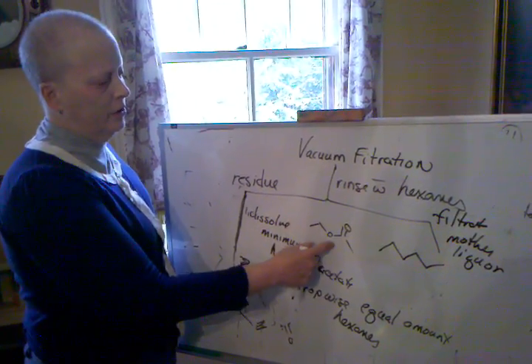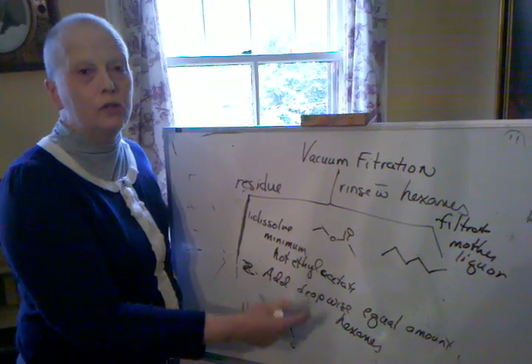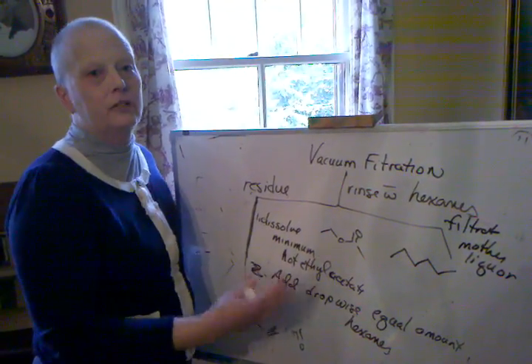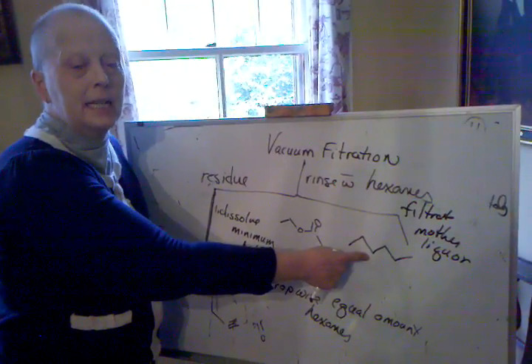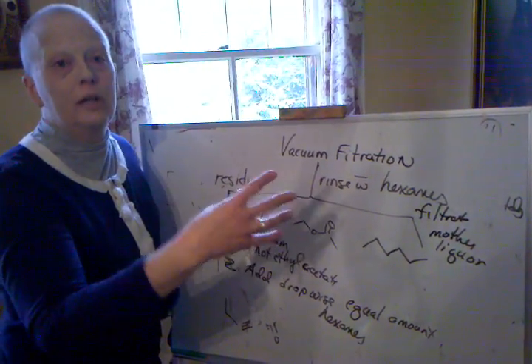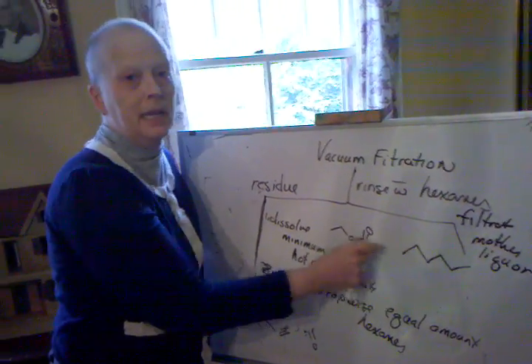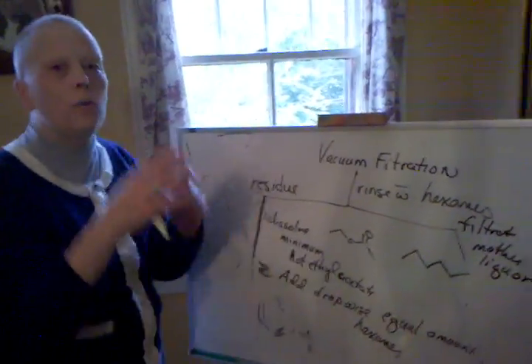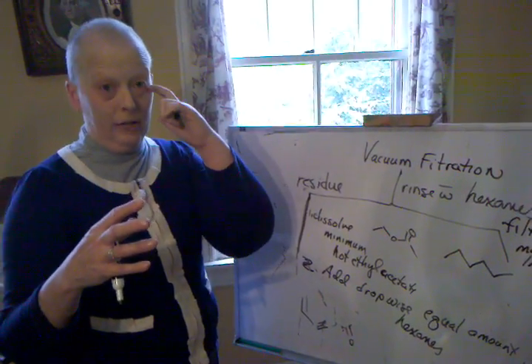Then what we're going to do is assume it wouldn't come out of the ethyl acetate because the ethyl acetate is too like it. It solvates it too well. So we're going to start introducing hexane molecules into that solution. What's going to happen to the solution? And by the way, these are mutually soluble. So if I mix these together, they form a clear solution. So what's going to happen to our Diels Alder product molecules, which are anhydrides?